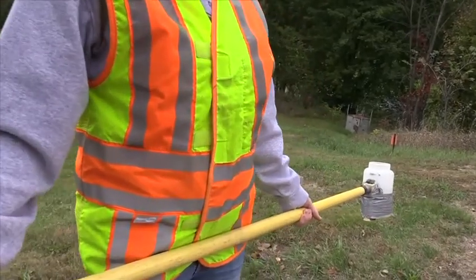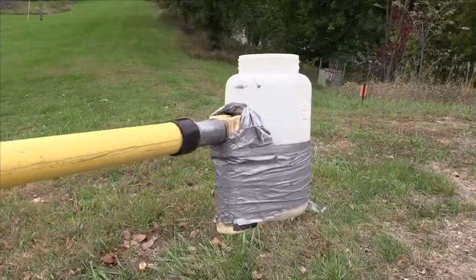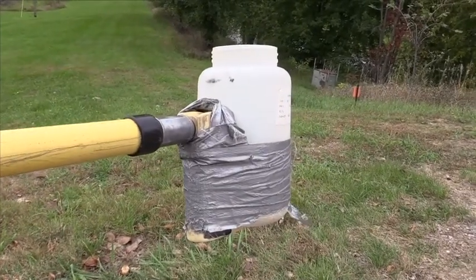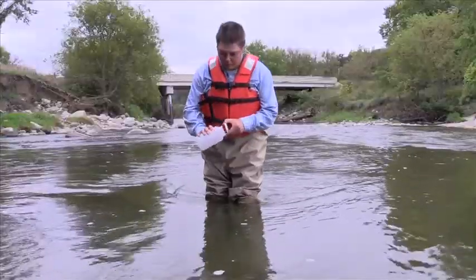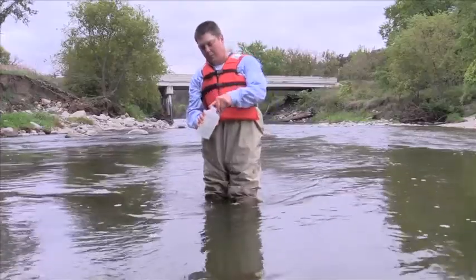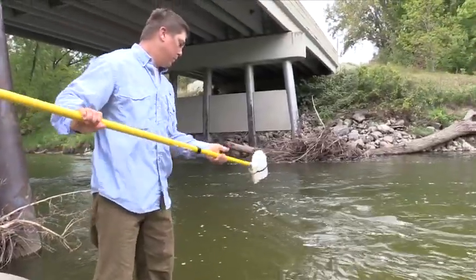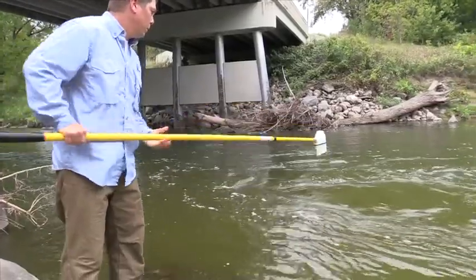Depending on site conditions, a telescoping rod may be needed to collect a water sample. This program provides a tutorial on how to do that. Mike Walarak is a water monitoring specialist with the Minnesota Pollution Control Agency. He's on Hawk Creek near Granite Falls to show how to properly take a water sample using a telescoping rod.